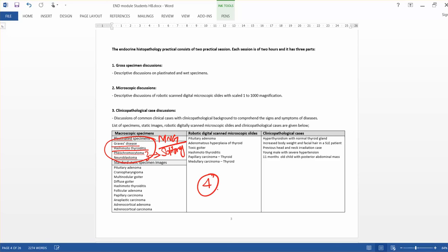All four are thyroid specimens. They are: diffuse thyroid goiter related to Graves' disease, and another specimen is a multi-nodular goiter shown as a wet specimen with formalin.